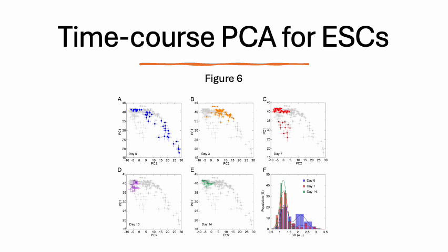But then they roll down into distinct valleys or lineages as development proceeds. In my opinion, what's especially interesting is that the author's proposed Raman spec could be used to monitor these kinds of changes in real time, and this would allow researchers to identify and isolate subpopulations of cells at specific points along the differentiation path, all without needing to use any destructive labeling techniques.